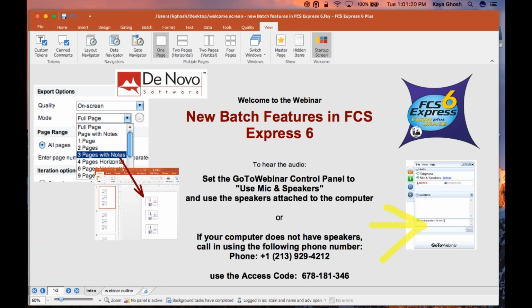Okay, welcome to today's webinar, New Batch Features in FCS Express 6. This will actually be a very short webinar. I would say it's probably going to be a little under half an hour. So we won't be taking up the whole hour because we're just going to be going over a few things.